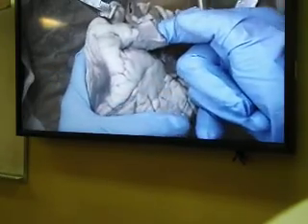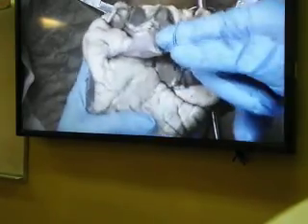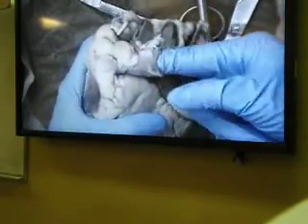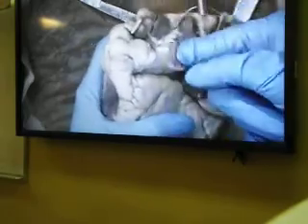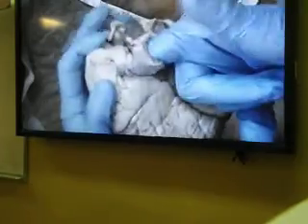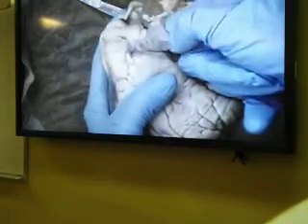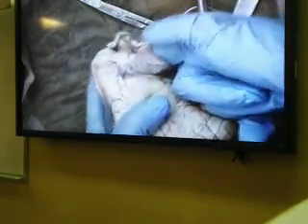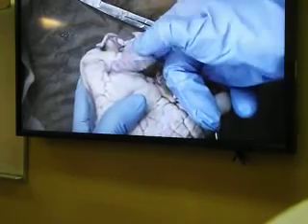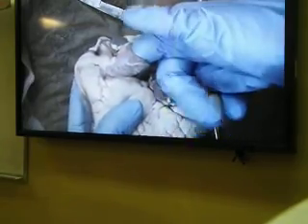In heart dissection, where each blood vessel is going is easy to understand, because you can follow those blood vessels through your finger or through the probe. So if I'm pushing through this blood vessel, it is going to this whole chamber, and this has to be the right ventricle. And so this blood vessel has to be the pulmonary trunk, which we just talked about, which gives two arteries, right and left pulmonary arteries, to take blood for oxygenation into the lungs.